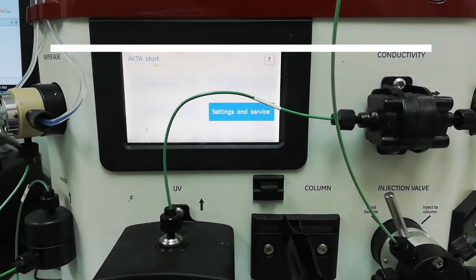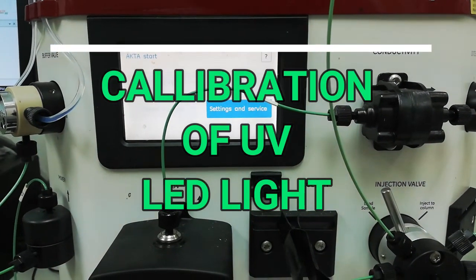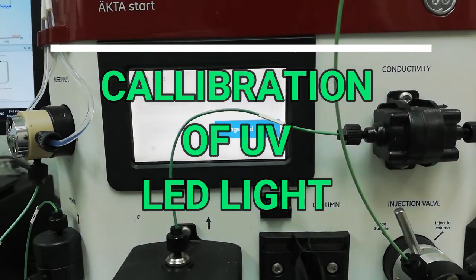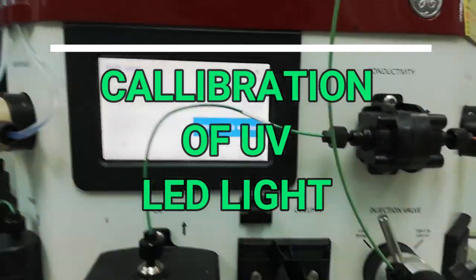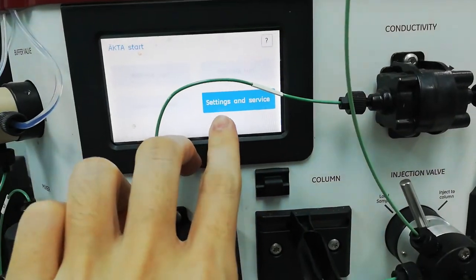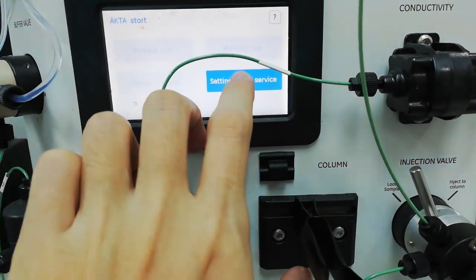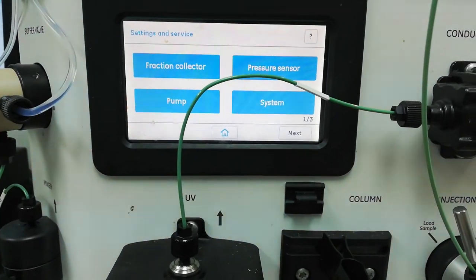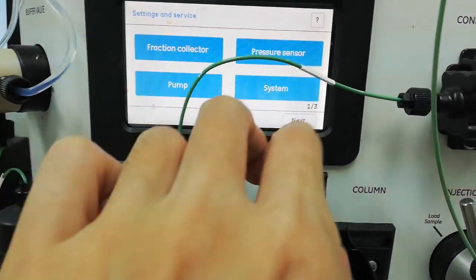Now I'm going to explain how to calibrate your UV light. First of all, you should press the setting and service button. Then you can choose service.